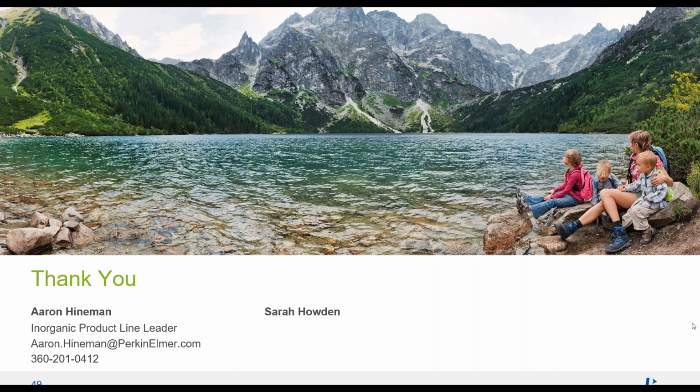Next question. So I have a question. It's more service related, but occasionally I have noticed when igniting, the flame changes from blue to quick orange. Does this mean there's uneven airflow? I see a spike in absorbance when this happens, and then it eventually comes to baseline.